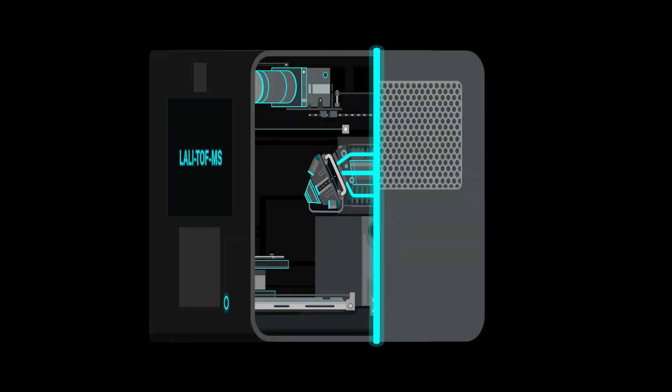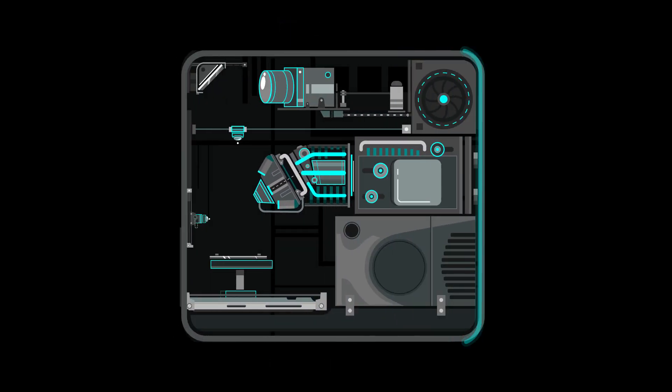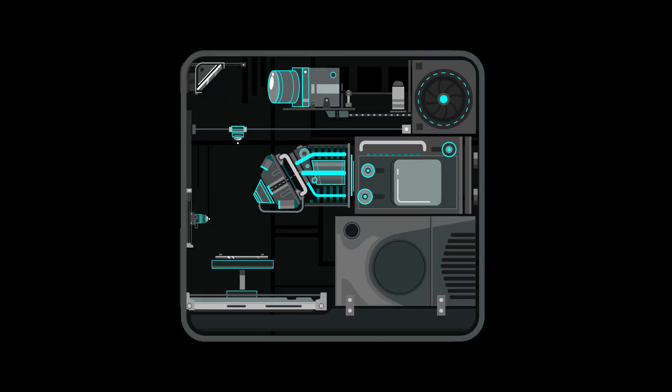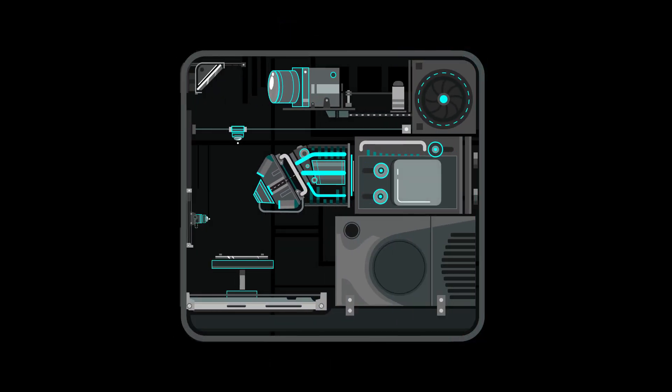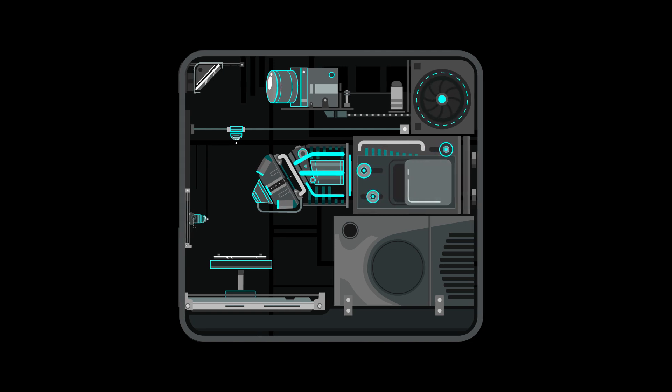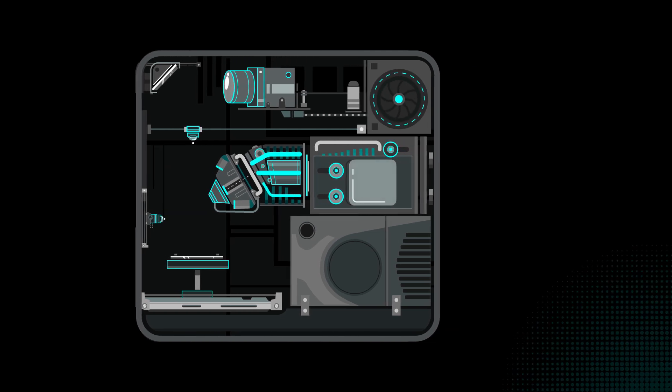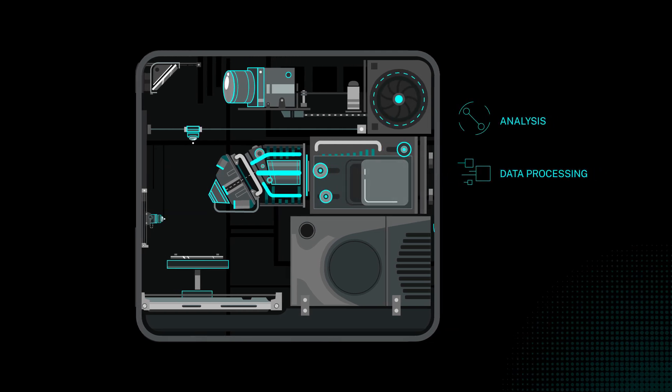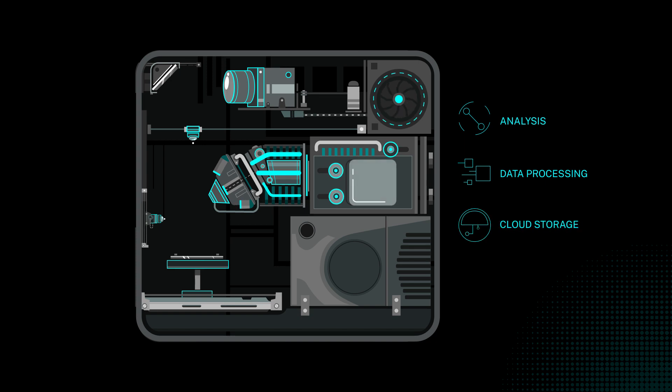MassBox brings a lab's worth of equipment into one desktop instrument that's as easy to operate as a smartphone and serves as a single hub for analysis, data processing, and storage.